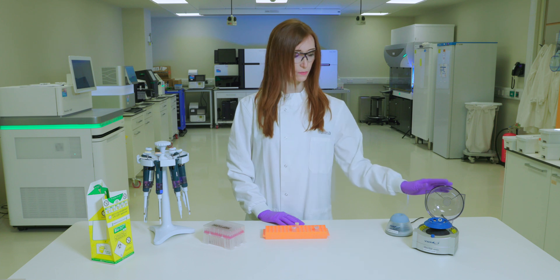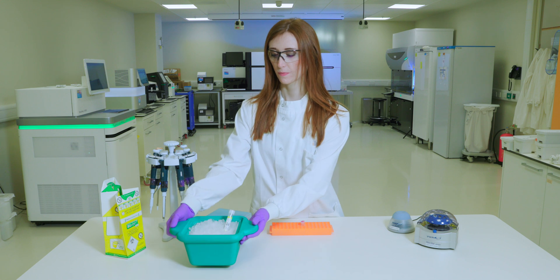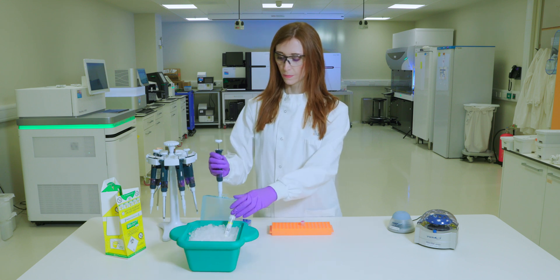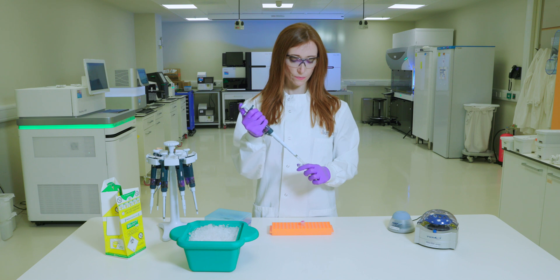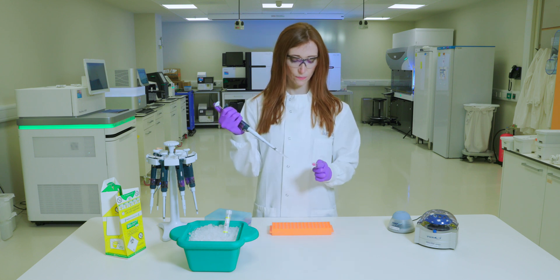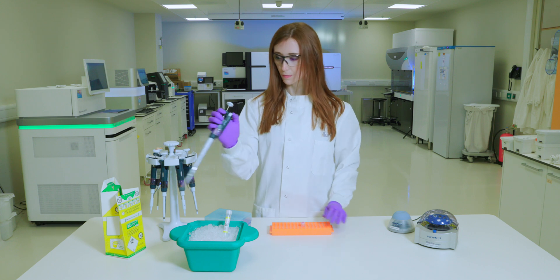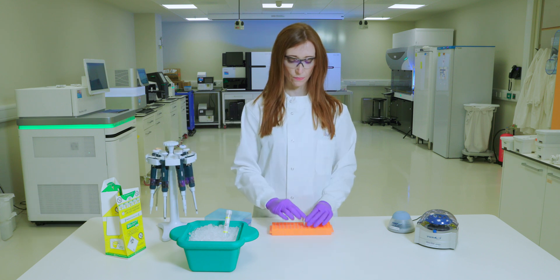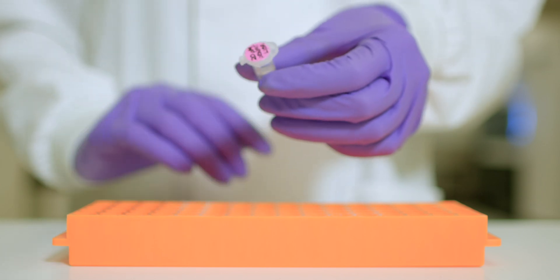Vortex briefly and then centrifuge at 280g for 1 minute. Incubate at room temperature for 5 minutes. We will now use the HT1 buffer to dilute the denatured library. Add 990 µL of pre-chilled HT1 to the tube containing the library, then invert to mix. This will result in 1 milliliter of 20 picomolar denatured library.